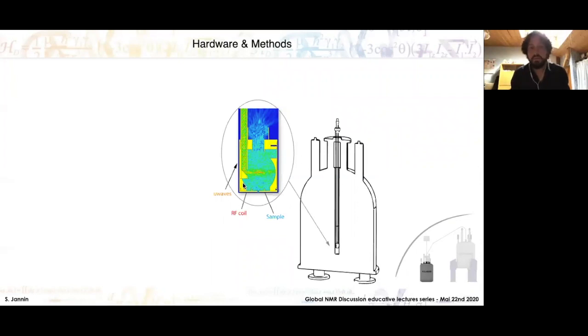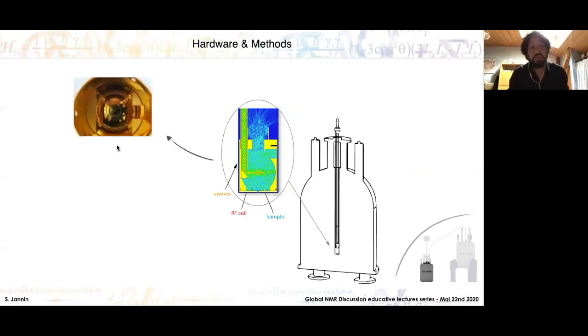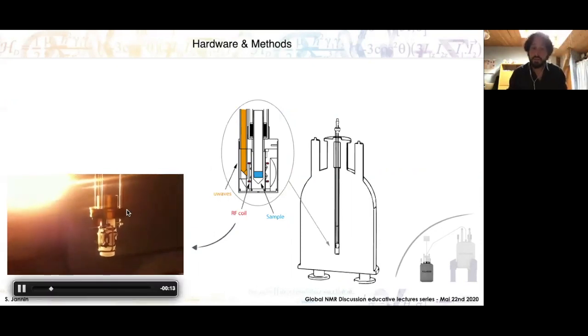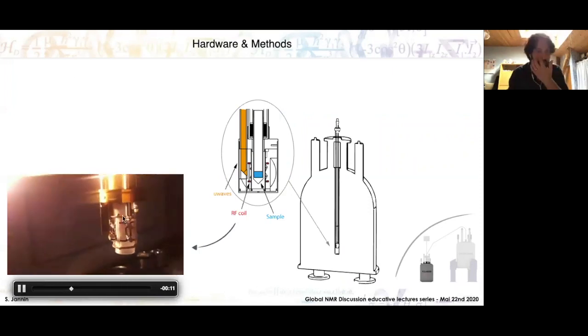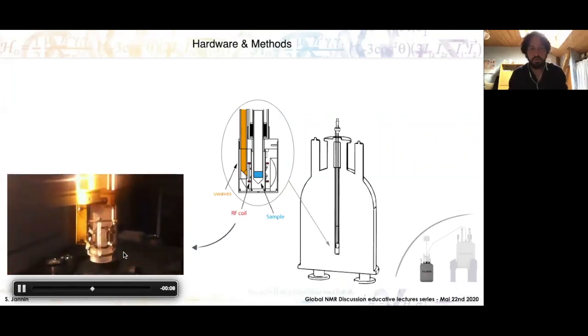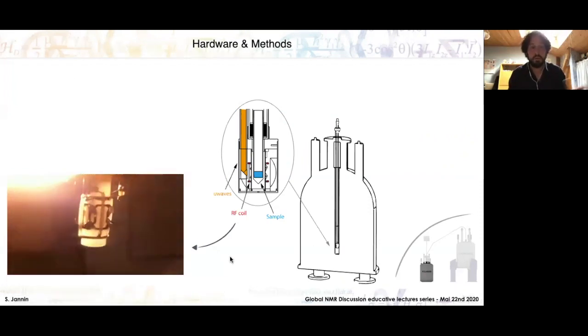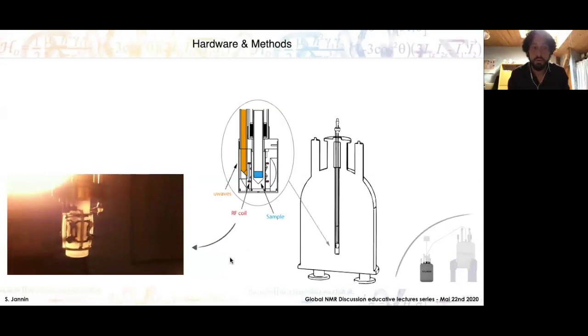Some of those cavities, we call them cavity, but they are basically just a box. They have some gold-plated reflective structure that allows you to really concentrate the microwave field on the sample. And then you may have a coil. Some of them have a coil to measure the NMR signal, to measure the carbon-13 buildup. This is one of the first versions of our coil that we have been using in Lausanne and now in Lyon, that has 2 nuclear spin capabilities, proton and carbon, in order to do a double resonance experiment, such as CP.